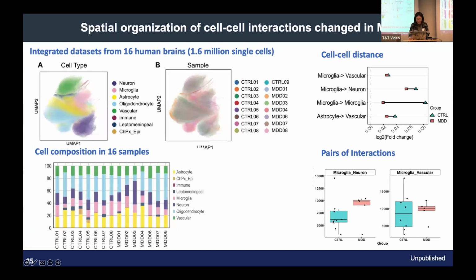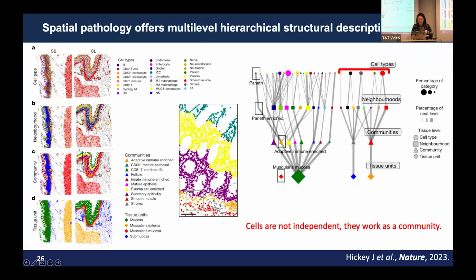And next, at the very top here, we identify what cell types are there. This is spatial biology, so we want to understand how they organize together, how they form neighborhoods. The way we define a neighborhood is by how similar the cell composition is in a random rolling window. We define a 200 micron rolling window and let it roll randomly across the image. If the cell composition is similar in any particular location, they're defined as one neighborhood.